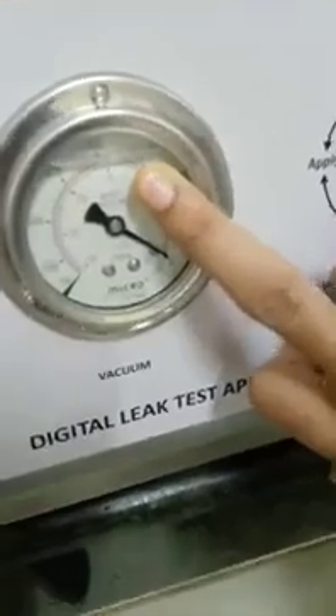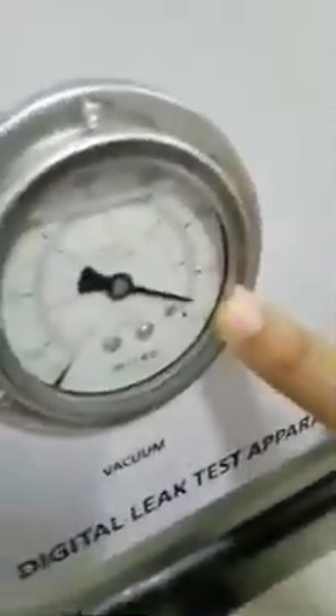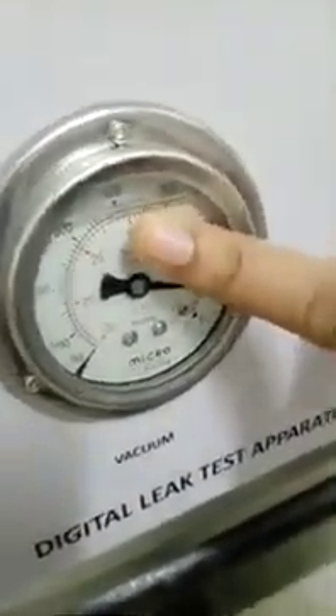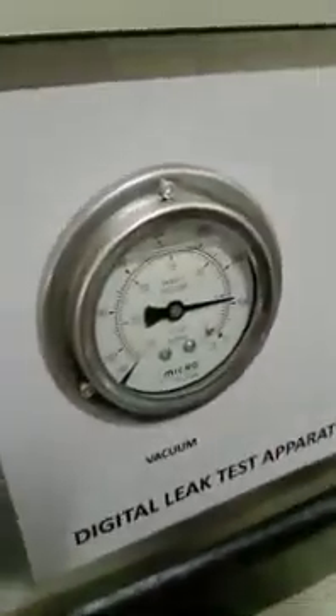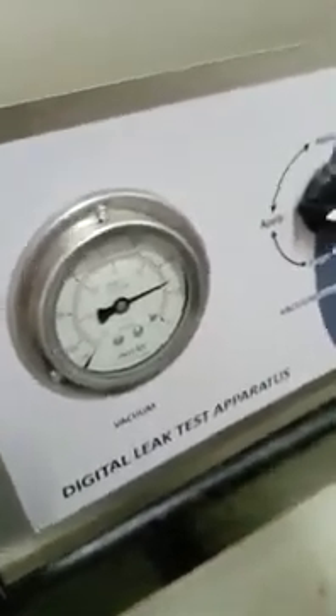We have to first start the pump. If we want to apply a pressure of 400 mmHg, we have to start the pump first. We have to wait and apply a little bit of pressure. You can see the dial is going up on the meter. We have to wait till 400. Here we go.